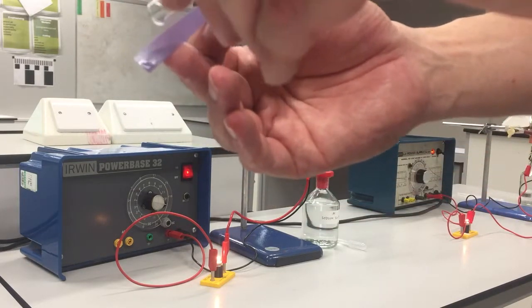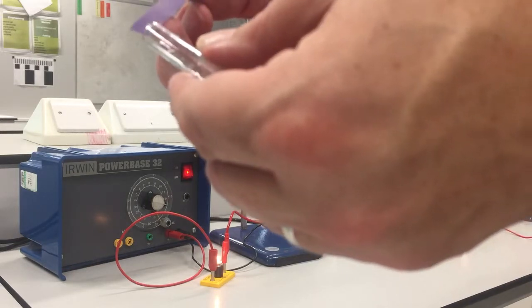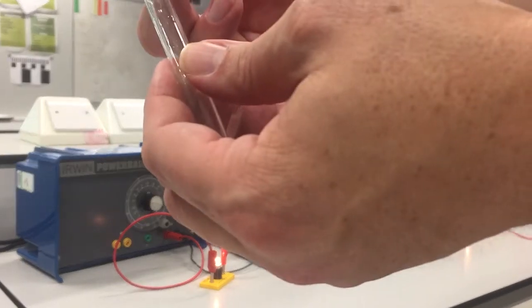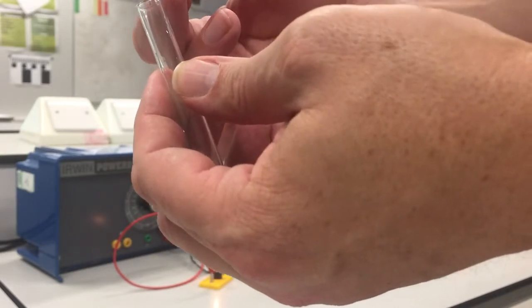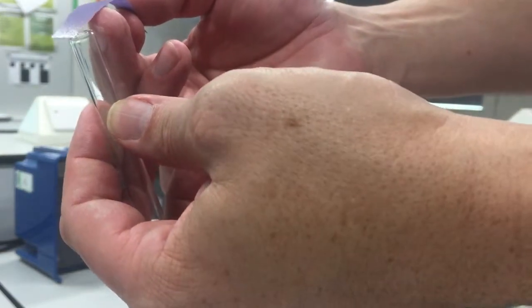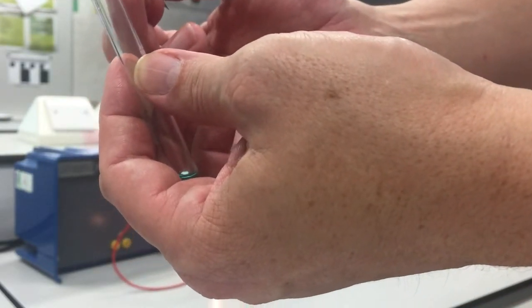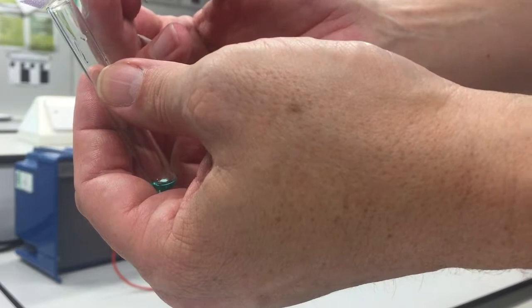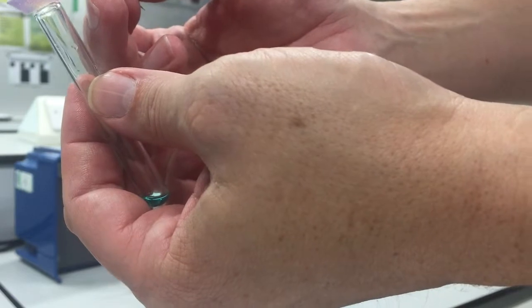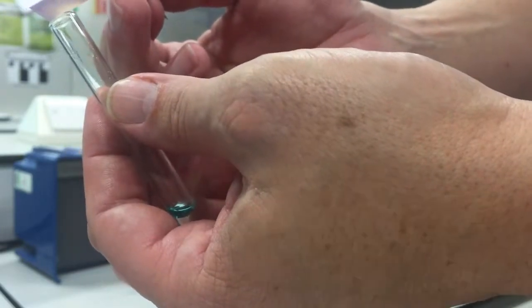So here we go. Going to leave that on there. It's very pungent. Remember, one of the safety points here is you should not inhale directly, just waft the gas. I can see that I've got a red patch forming on my paper, and eventually that red patch will just go pale as it's bleached. So that's our test for chlorine. And that was only produced after about 5 minutes. Didn't take long to produce the chlorine.